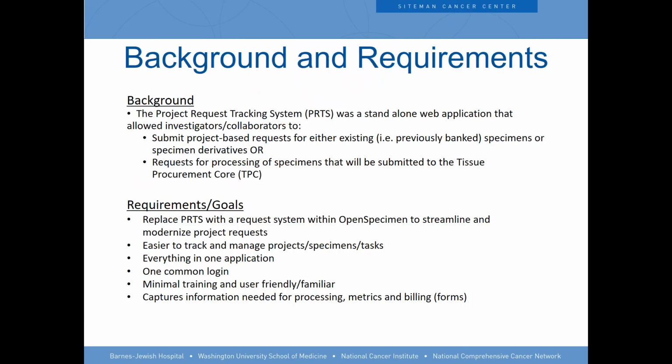But the point of it, and it had a very, very simple use case, was a user would log in and enter what they wanted done to specimens, either that they were going to drop off to the lab, or specimens that were in the lab that they wanted pulled out and things done to.